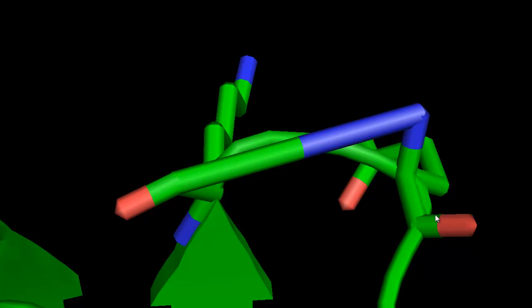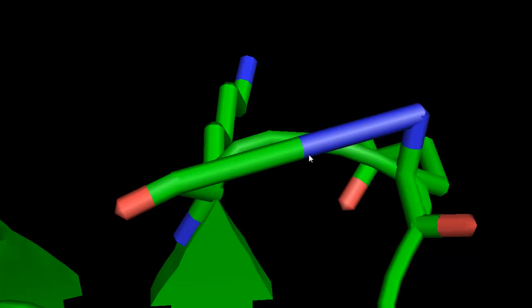In reality, although the loop has shrunk, and the structure is definitely different from before, this may not be the true structure. Because this bond is way too long, and obviously we need to reassess the bonding energy, and perhaps we need to accommodate for rotomeric changes that need to happen in order for this to be an acceptable mutation.